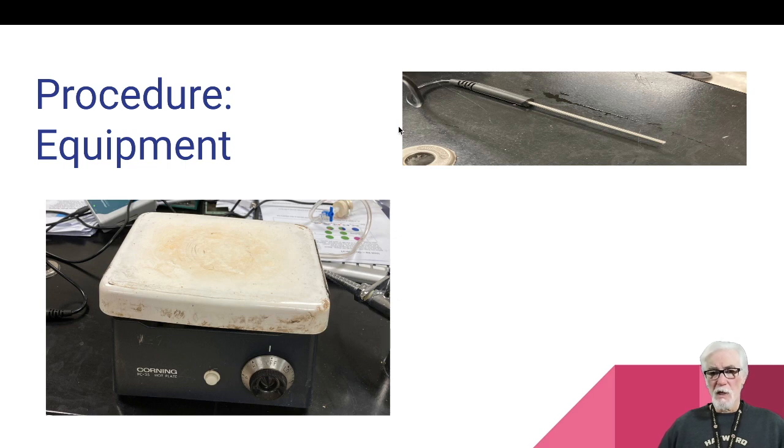We'll measure the temperature using a temperature probe, and that temperature probe will be inserted into a water bath, and the water bath will be on a hot plate. So we're not going to directly warm the air, we're going to warm up a bath of water that the air will be immersed in, and then we'll measure the temperature of the water bath. If we heat it up slowly enough, we should have the same temperature, or approximately the same temperature, of air as we do the water outside the air.